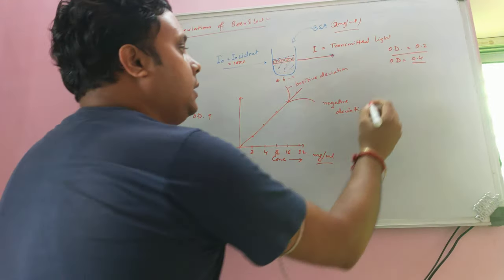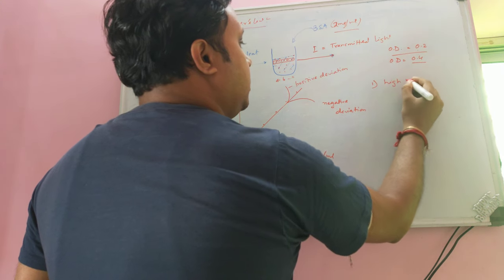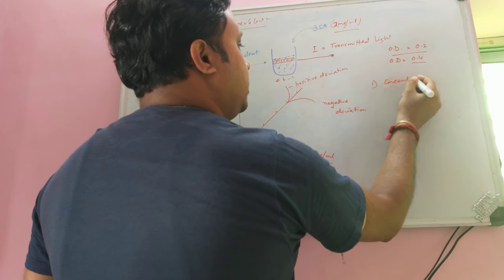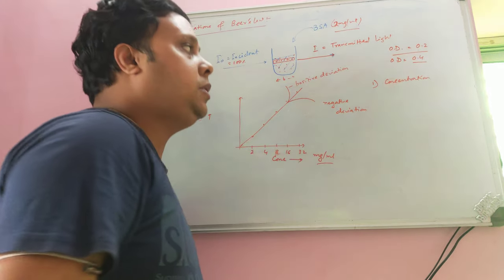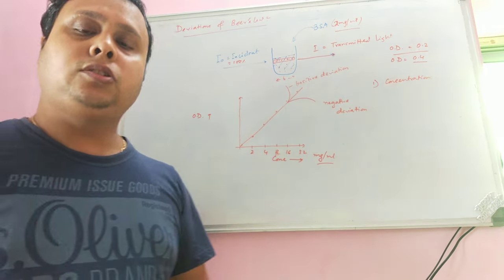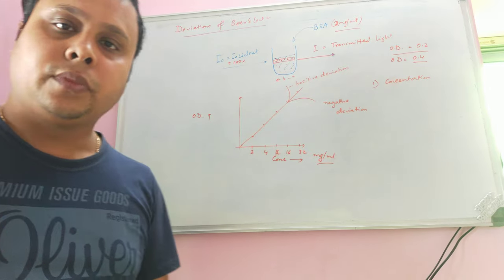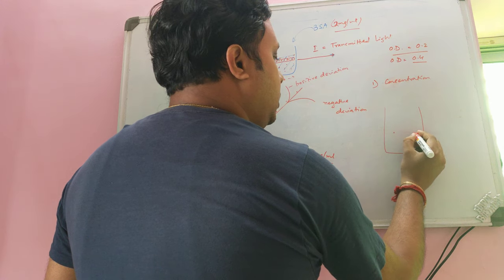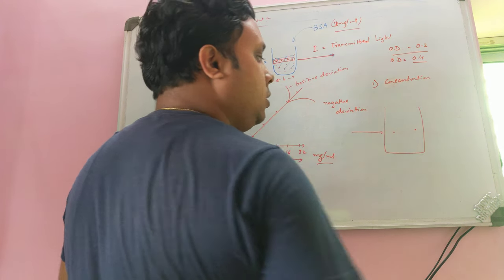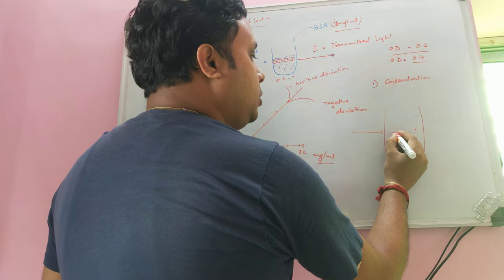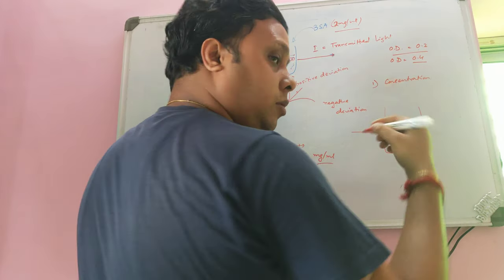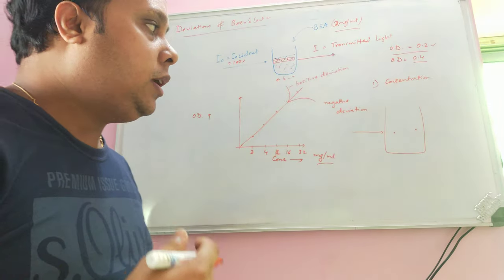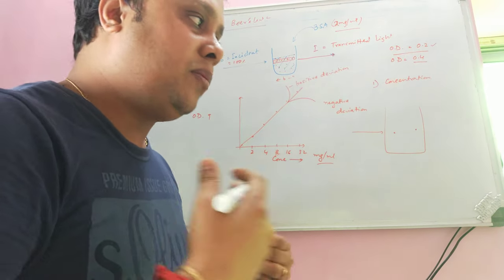The first cause of deviation is concentration — specifically high concentration. According to Beer's Law, the more the concentration, the more the OD. In a cuvette with two molecules present far apart, each molecule absorbs light independently and you get an OD of, say, 0.2. But when we add more molecules, increasing the concentration, more molecules are present nearby.